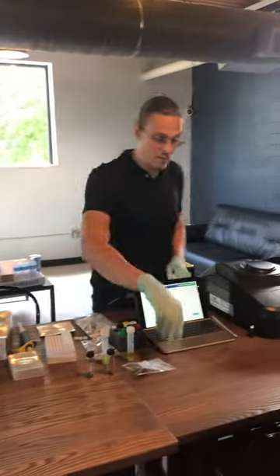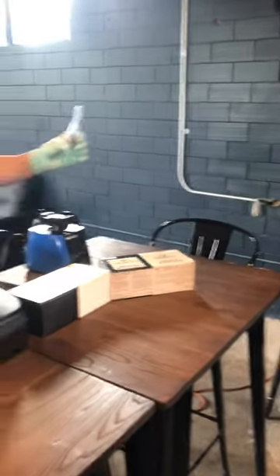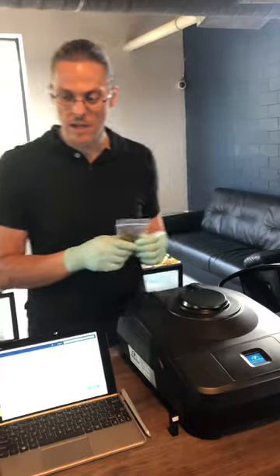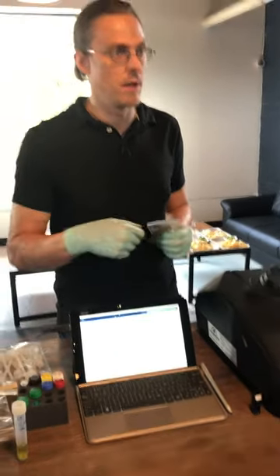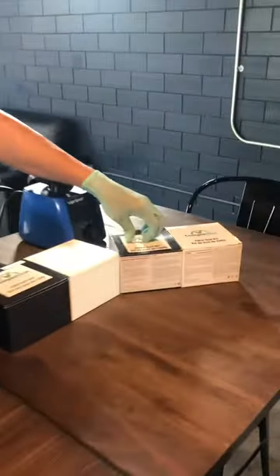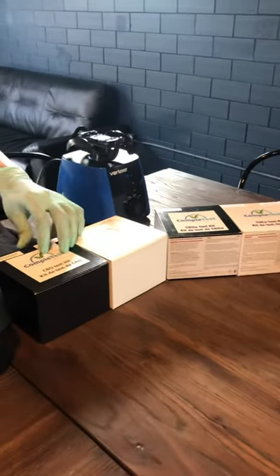For this test, you're using just straight cured plant matter, not DCARB. And for the DCARB test, you're taking this, sticking it in the oven to decarb it, and then doing the same extraction procedure. This one tests down to 0.2%, this one tests down to 0.75%, and these tests down to 0.1%.